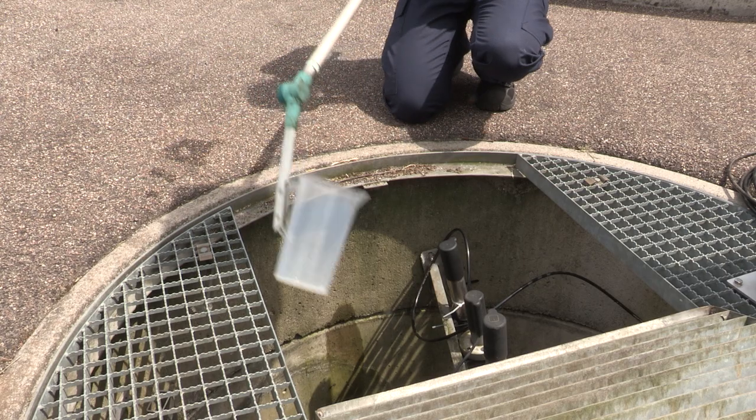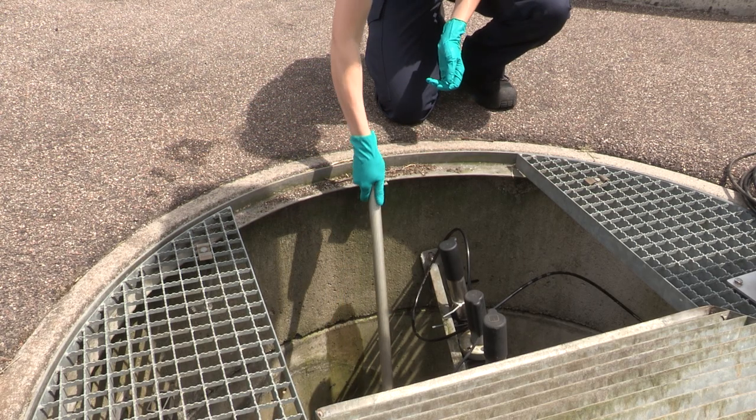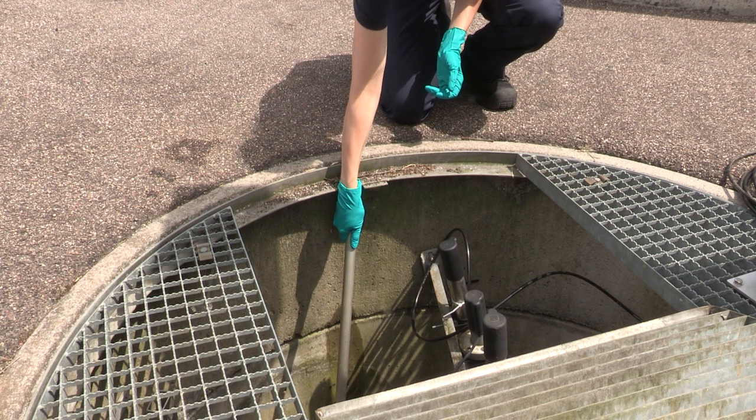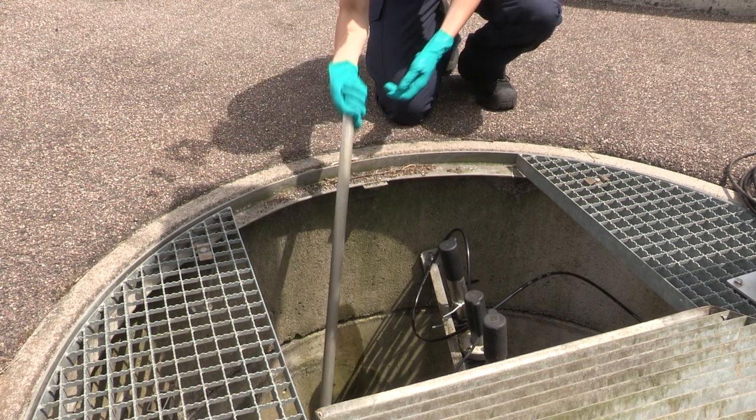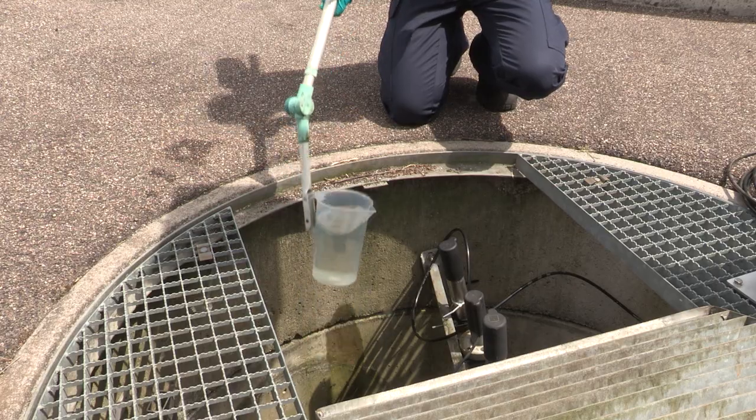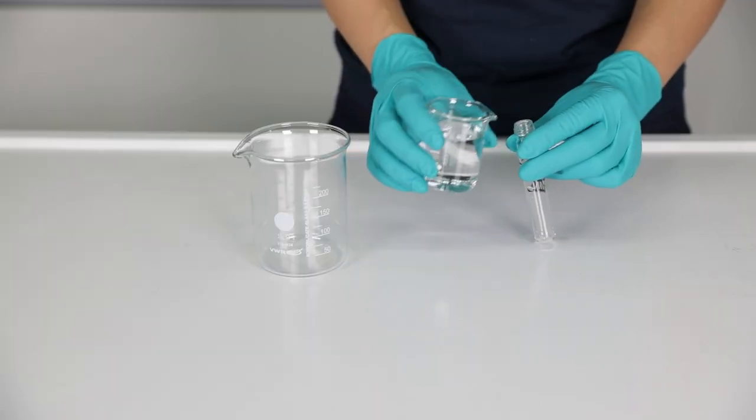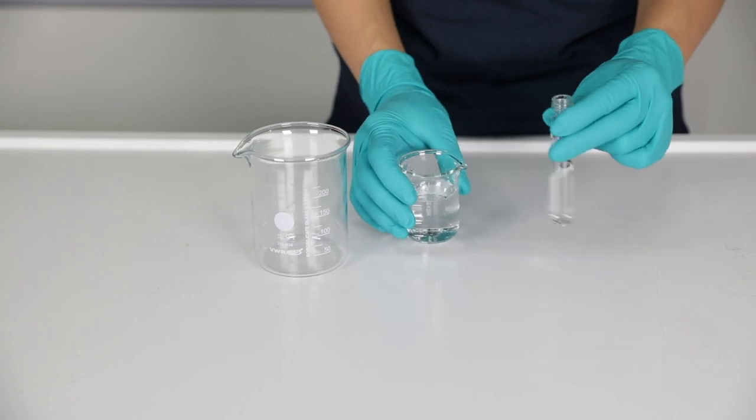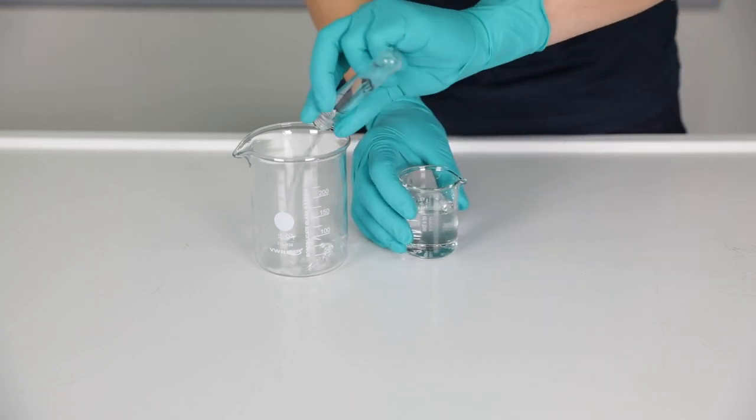First, start with the serial measurement of the photometer. Therefore, take a sample out of the process close to the assembly. Then, take some sample water and rinse the cuvette carefully several times.